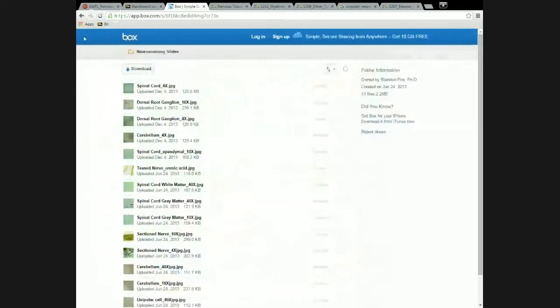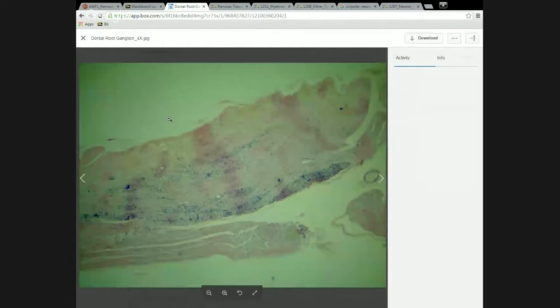Now, the next slide I want to show you is of what's called the dorsal root ganglion. So earlier when I was defining ganglia, I showed you on this vertebral column model with the yellow rubber nervous system inside of it, that the base of the nerves coming out of this is a little thickness, which is a ganglion, which is what we have on the slide right here.